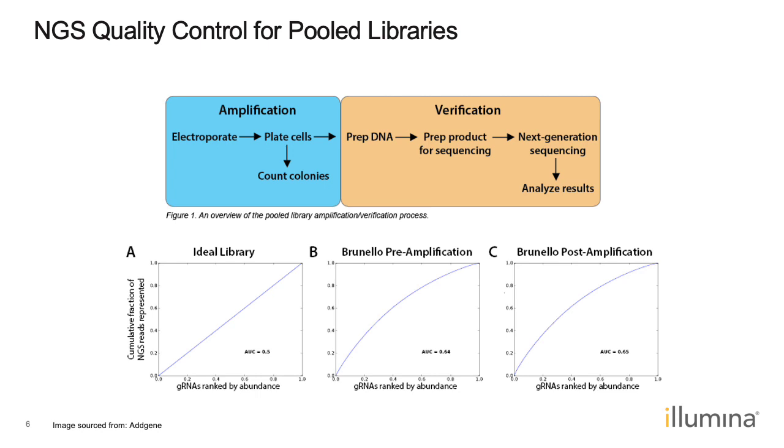And so the best way to do this is to include a sequencing step for quantification of the plasmids to ensure that all of your plasmids have amplified evenly and that no plasmids were lost or amplified preferentially, or that you are not missing or overrepresenting any one guide, for example. To do this, you're going to extract the DNA from your colonies and sequence your plasmids via methods such as Illumina sequencing to identify your target guide RNAs. Typically, it's also helpful to sequence both pre and post amplification so that you can compare the numbers or populations of guides before and after as well.